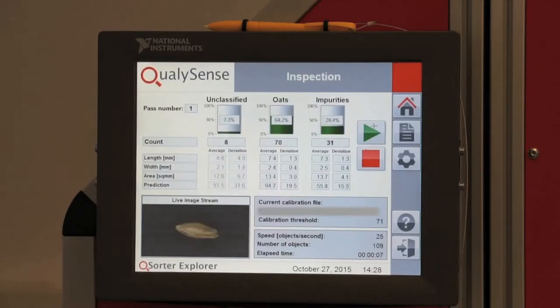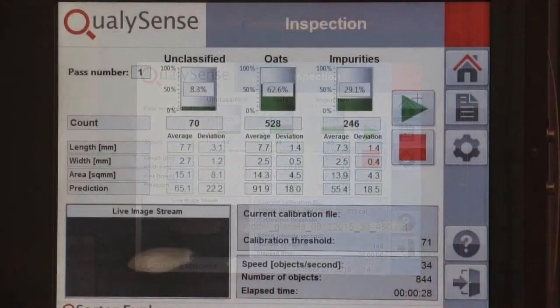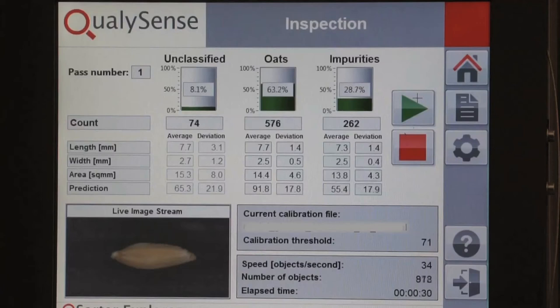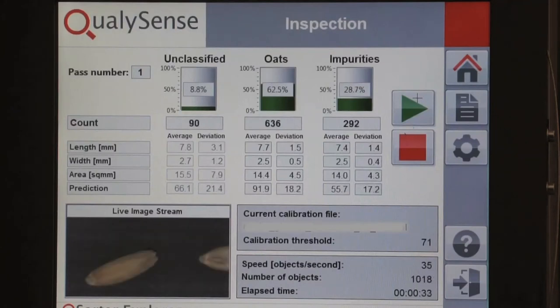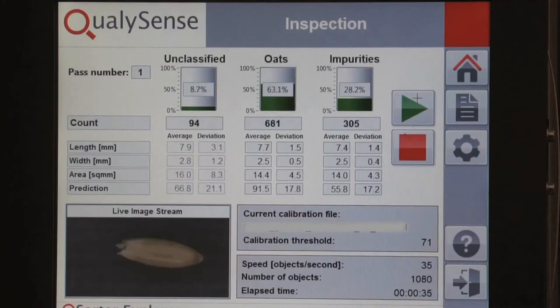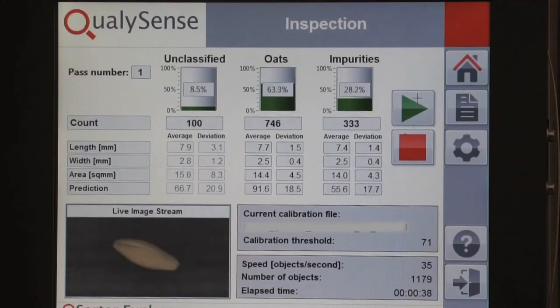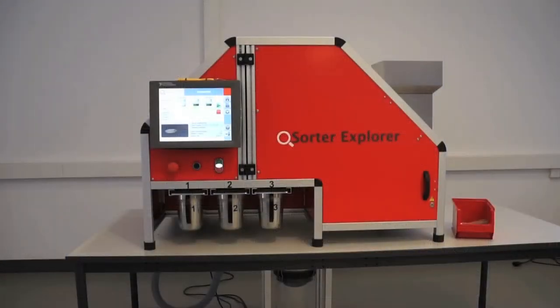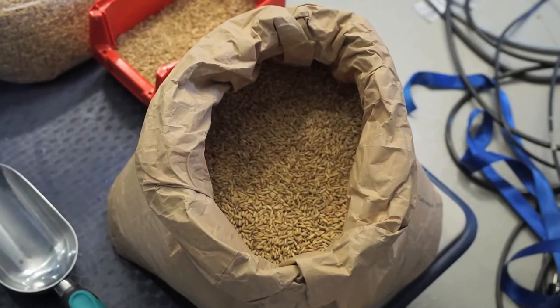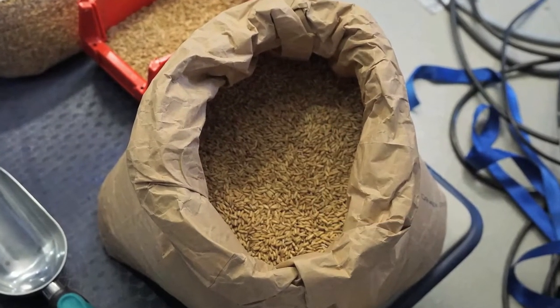The Q-Sorter Explorer can process over 50 samples per second, delivering information on each individual kernel regarding size, color, moisture, protein, starch content, and many other parameters. With such rich information available in just minutes rather than hours, Q-Sorter Explorer users gain a very detailed understanding of the crop they are purchasing upon receipt.